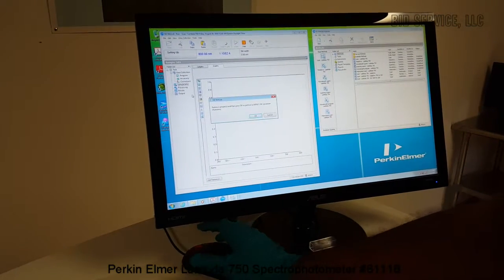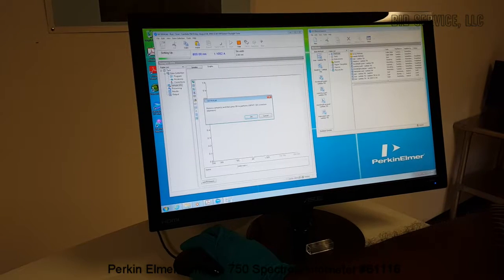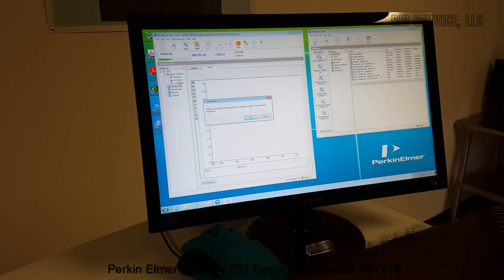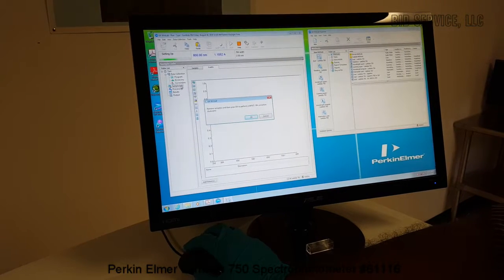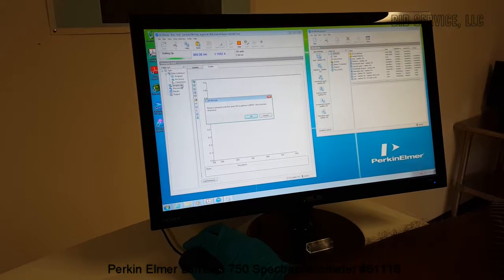The unit requires about 30 minutes of warm up time after power up.